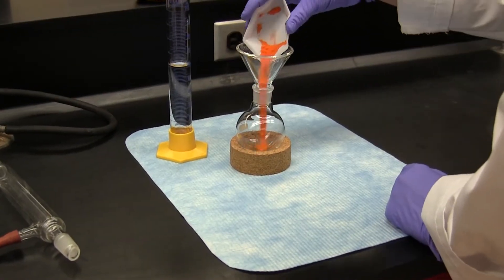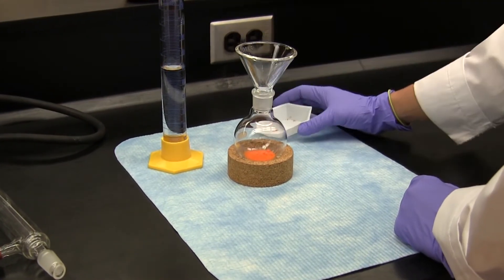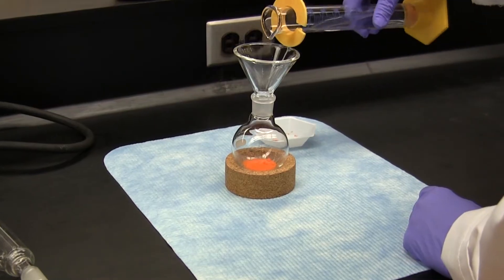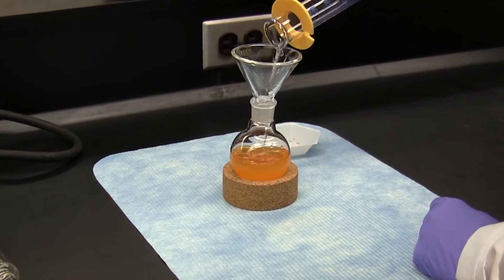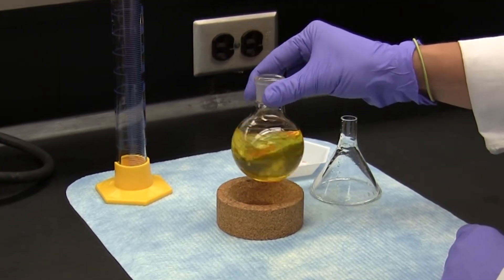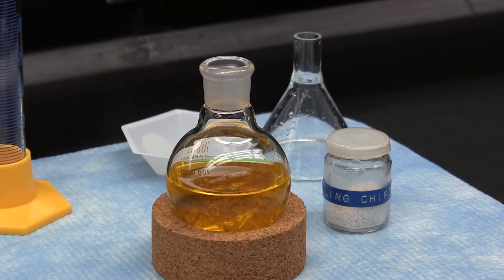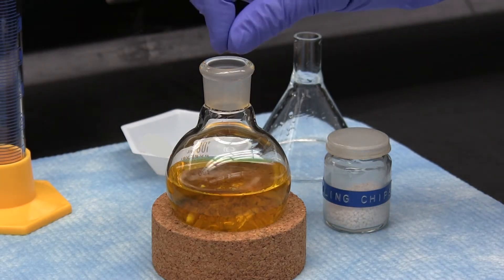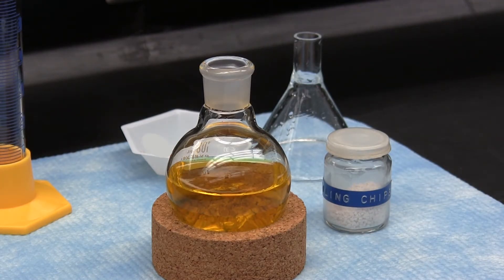So here we see Lauren adding the reactant to an RB flask followed by a solvent. A quick mix and the reactant is now dissolved in the solvent. A boiling chip is added. This helps to prevent bumping once boiling.